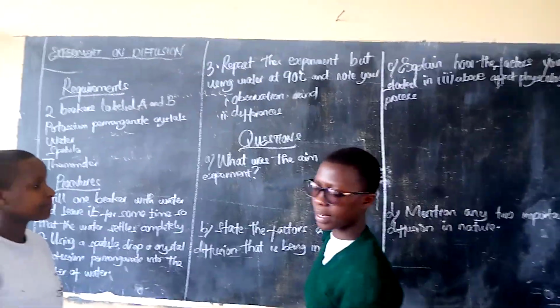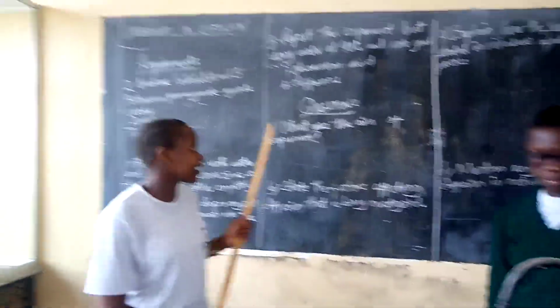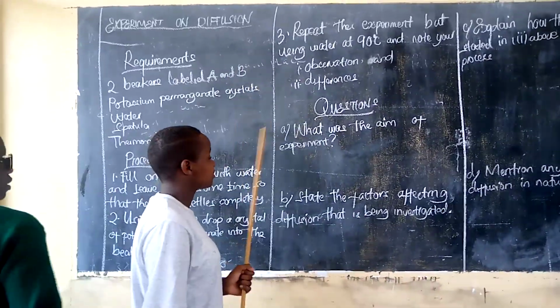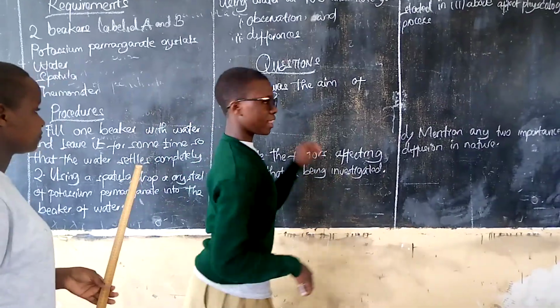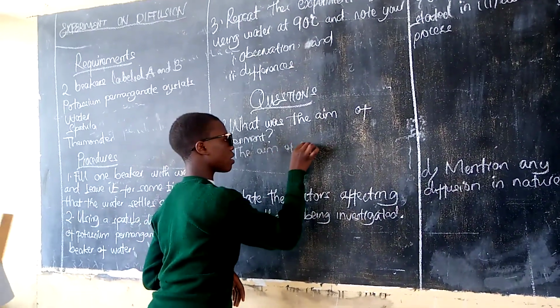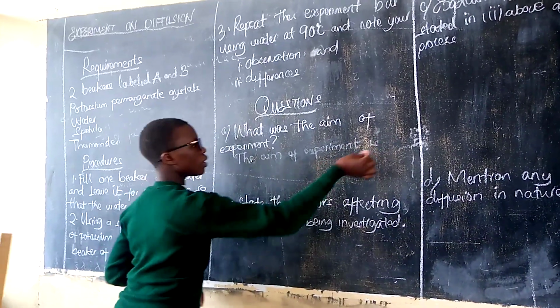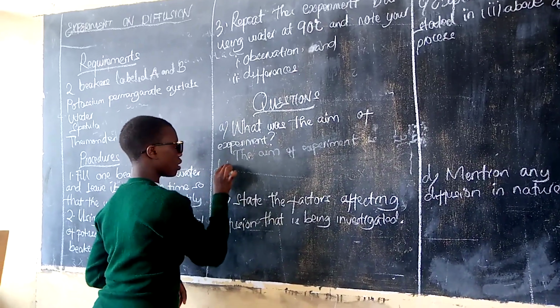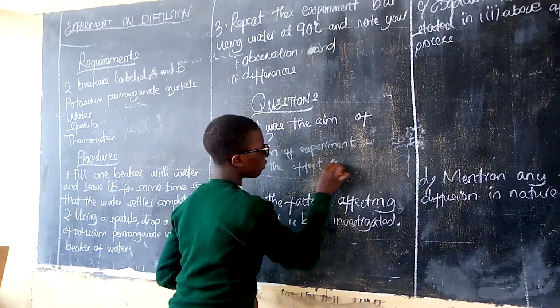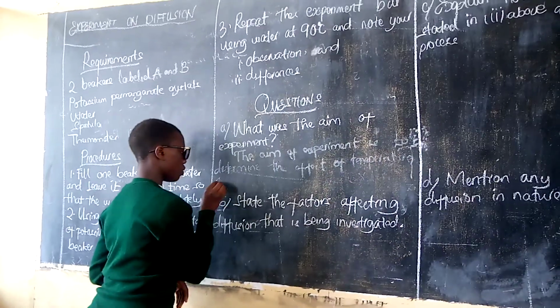What was the aim of the experiment? The aim of our experiment is to determine the effect of temperature on diffusion.